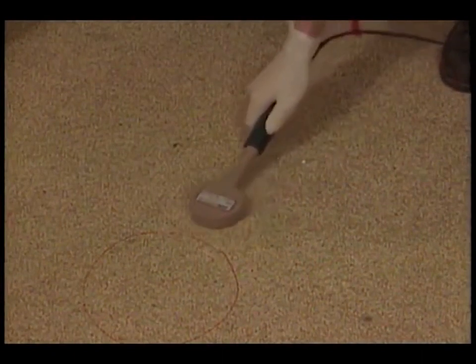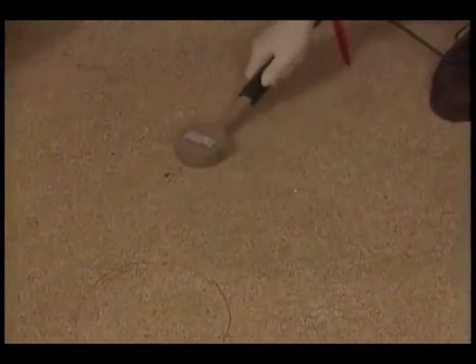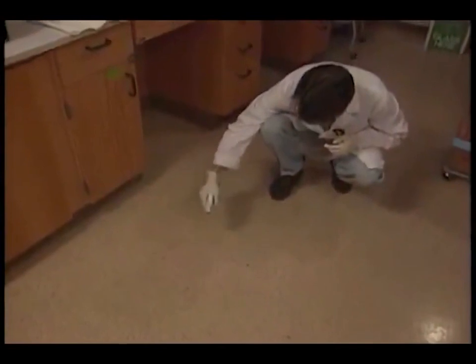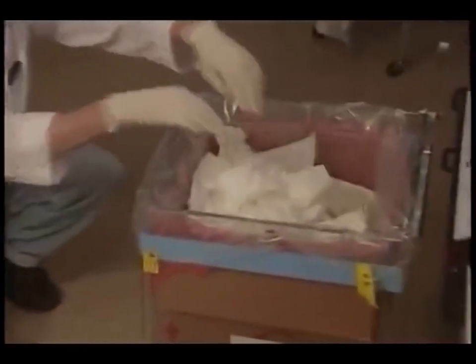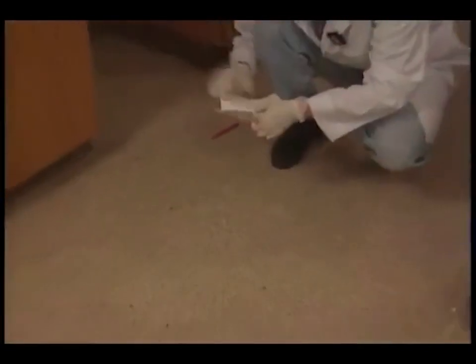Randy knows that this is a minor spill, one that he is trained to clean up himself. But if he had any doubt, he would call the safety office. Of course, all radioactive waste goes into a proper container. A high phosphate solution aids the cleanup. The process must be repeated until no significant radiation is detected.